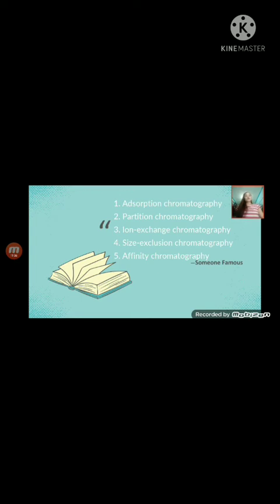Among these, the most widely used variant is the reverse phase mode of the partition chromatography techniques, which makes use of a nonpolar hydrophobic stationary phase and a polar mobile phase. The mobile phase is a mixture of water and other polar solvents.